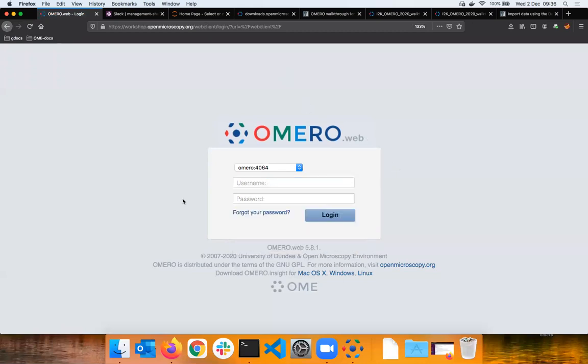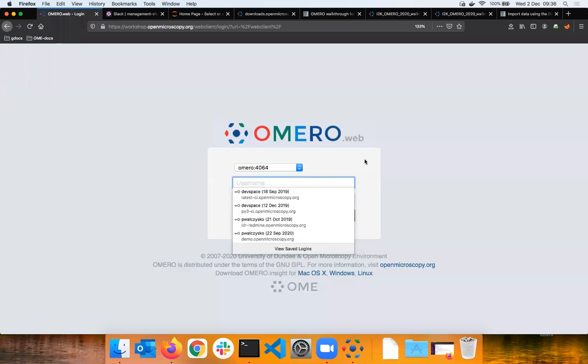Okay, so do you see something like this? Because I would like you to be able to work with that. So if you can be so kind, give me some hint. Yes, thank you. Great. So for yourself, I will just say, for first time, I will log in as user 50. Okay.